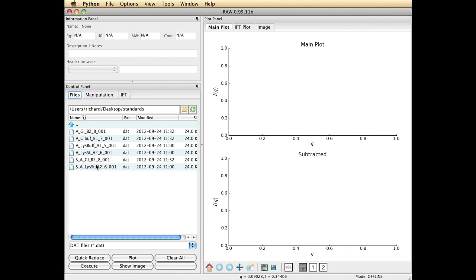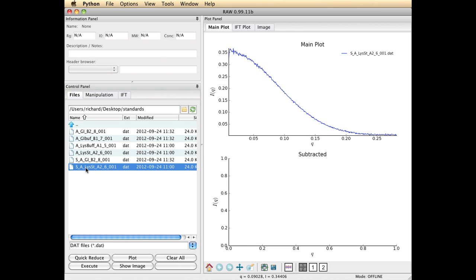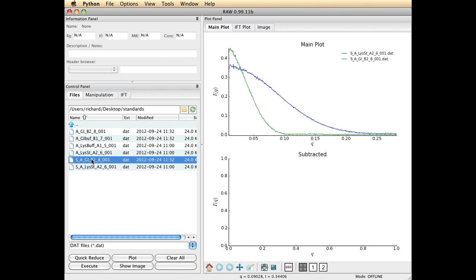Your data files may be named something different, such as .rad files, but the principle is the same. To load a profile into memory, all I do is double click on it. So I'm going to double click the lysozyme and the glucose isomerase.